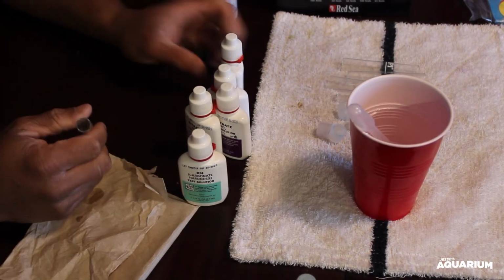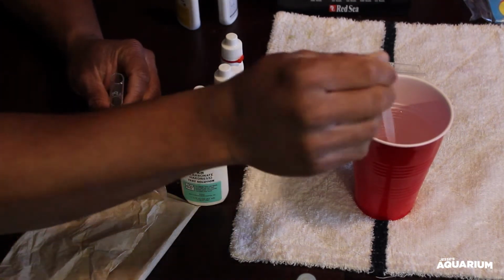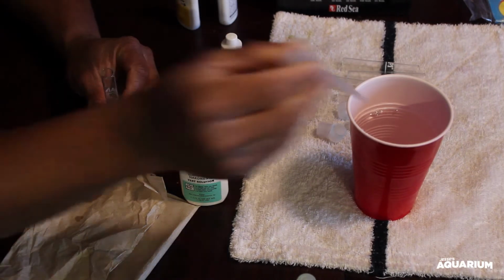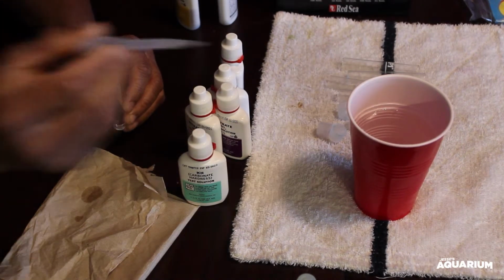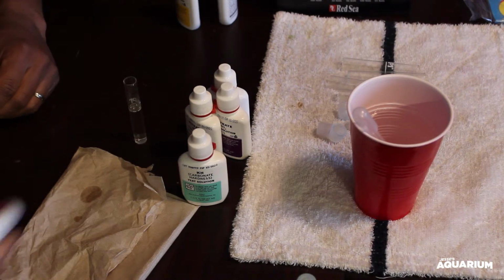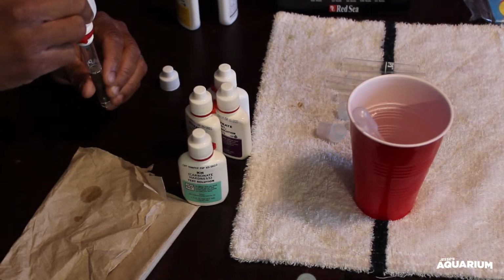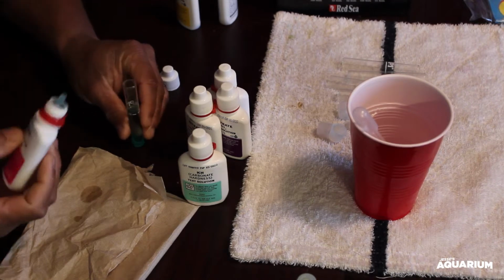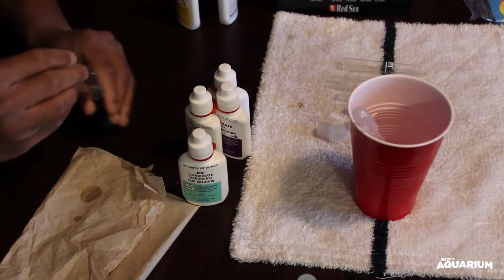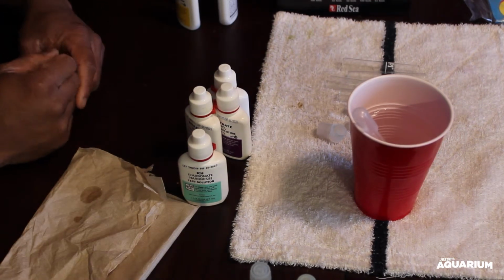Next one we'll do is a nitrite. I normally don't do the nitrite test because the tank has already been fully cycled, and I know what my nitrite levels are. It's going to be 0, but we'll do it just for those out there who've never used the API test kit before and know what the nitrites are in the nitrogen cycle. We have to administer 5 drops of this nitrite solution. 1, 2, 3, 4, 5. Let that sit 5 minutes.